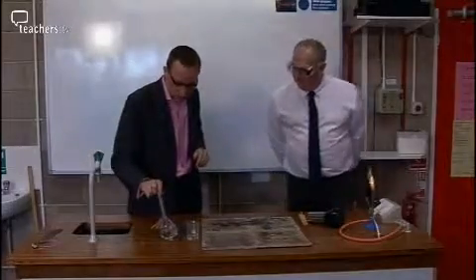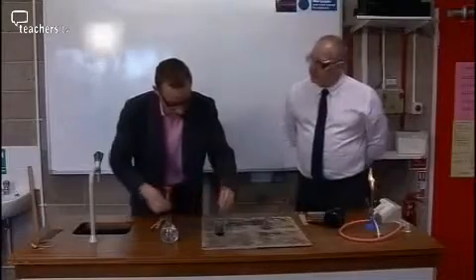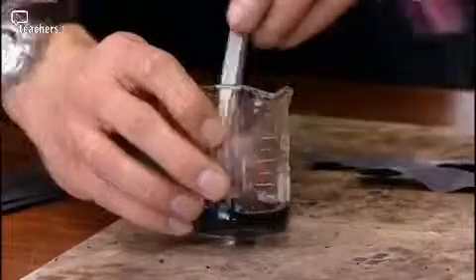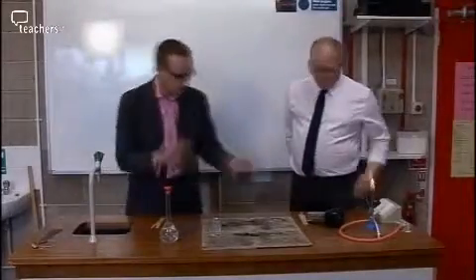We have our solution of potassium nitrate — a saturated solution — and it's literally a case of taking some strips of paper like this and dunking it in, making sure it's really soaked. You really want that soaked and really embedded in the paper. The time-consuming bit next is to dry it out — I usually use a hairdryer. To demonstrate the fuse, we'll use these ones that we've prepared earlier. So we'll just move that wet one out of the way.